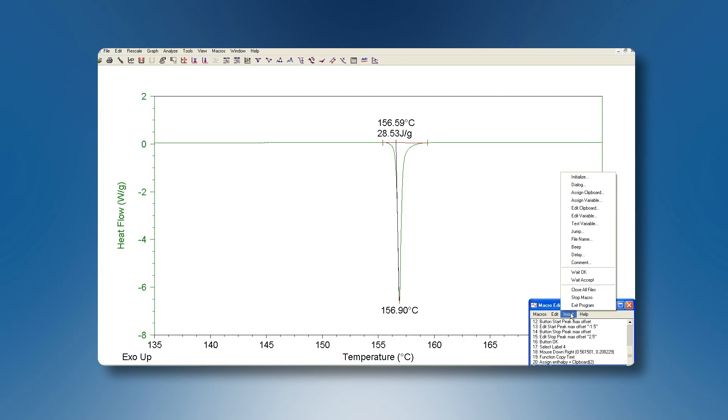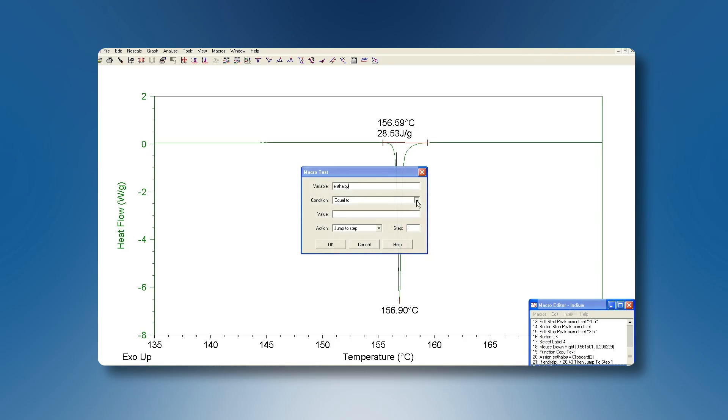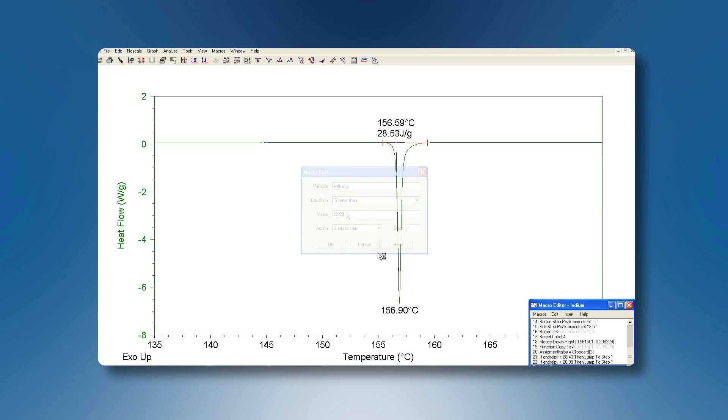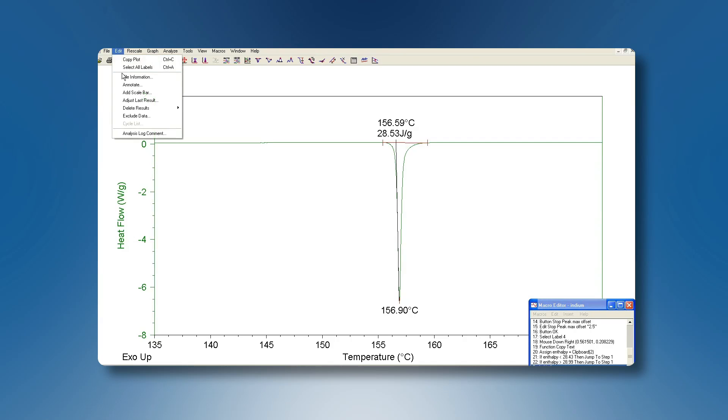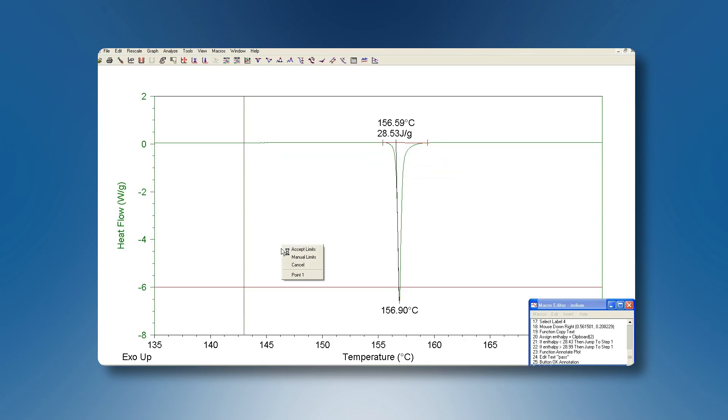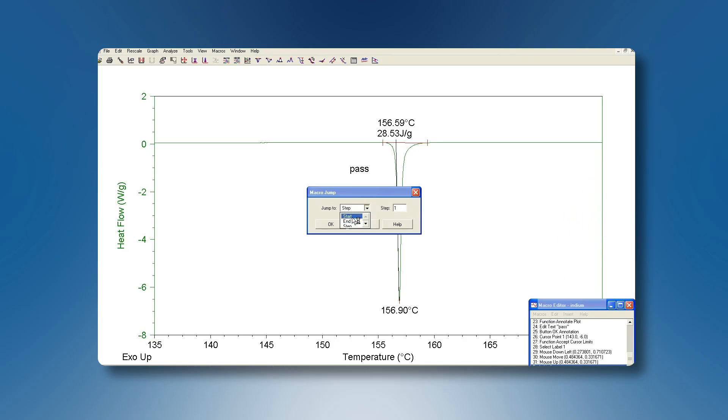We can do that under the Insert menu. If it is smaller than 28.43 we want to display a fail message. We will create this message in a step that we will define later. If it is bigger than 28.99 we want similar. If the value is within plus minus 1% we want to display a pass message. So let's insert an annotation pass. Now this pass part is finished, so we will insert a jump to the end of the macro.